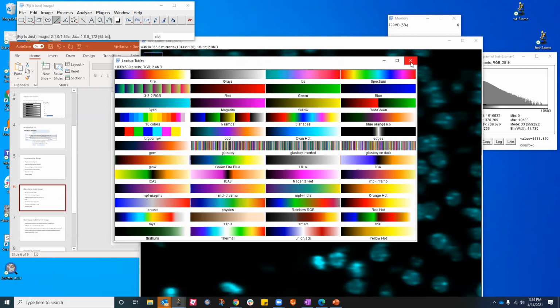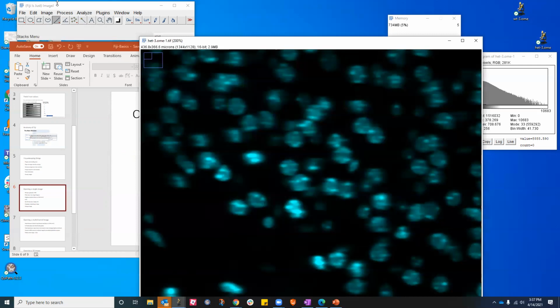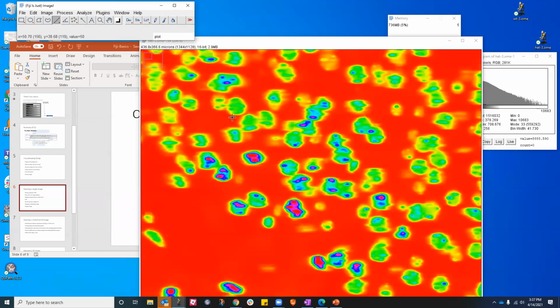If you have a Z stack, in the Z stack you are making a composite image. And I'll demonstrate all these things. When you make a composite image, you want to show the depth as a heat map projection. So you can say that the stack all the way at the bottom has this color, whereas the stack all the way on top has this color. So you can assign a spectrum kind of display table to the entire Z stack. Oh, that's cool. Yeah. I mean, even right now, we can go and say this is spectrum, right?